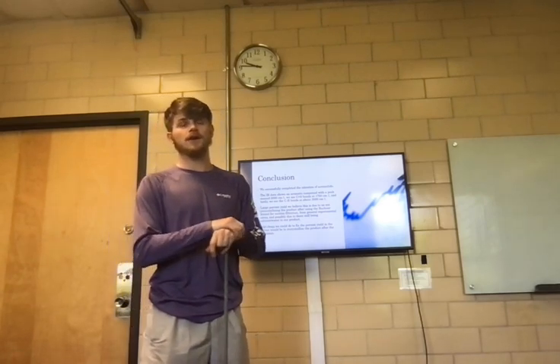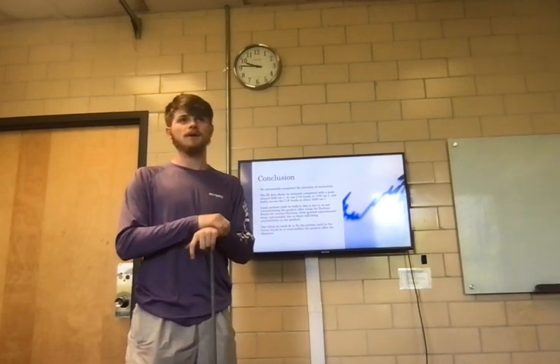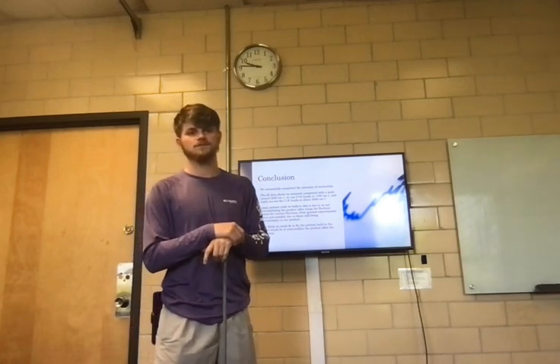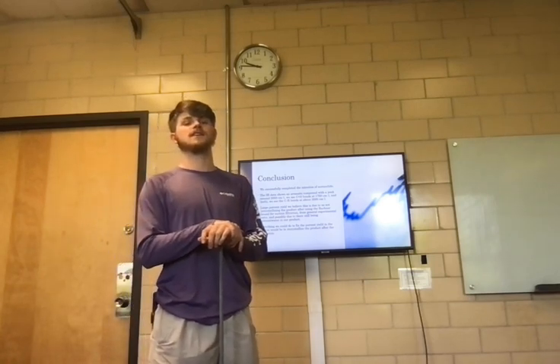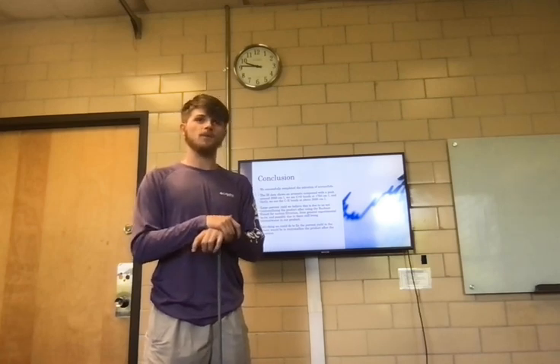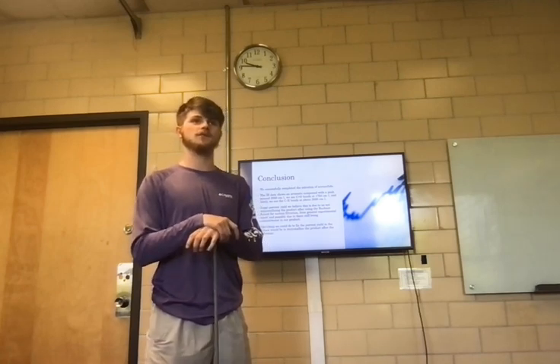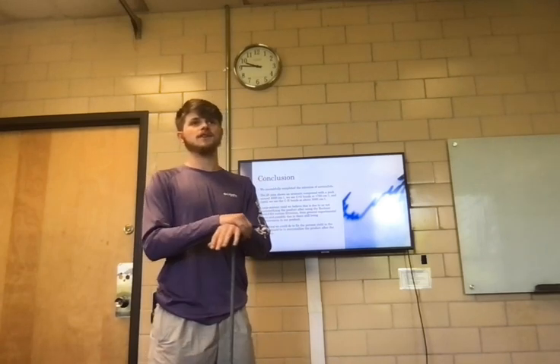We have our C double bond O's at around 1750, and we have our C-H bonds at around the 3000 mark. Also, as you saw with Brody, we had a 411% yield, which is not ideal, but we believe that is a result of not recrystallizing after filtrating.